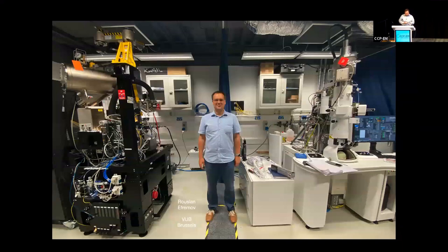So I'll leave this part of the talk with this picture, which is a picture from our lab. This is Ruslan Efremov from Brussels, who many of you may know, and he was coming to visit to see the microscopes. And we have the Thermo Fisher Tundra, which is a nice 100 keV microscope developed by them, probably from our encouragement, and which is a very good step in the right direction. And then this is the put together prototype that we had. So we're hoping that soon folks like you or Ruslan or anybody else will have a choice of 100 keV microscopes that will be both cheaper and better than what we have right now at 300 keV. So I'm hoping that's going to be soon.